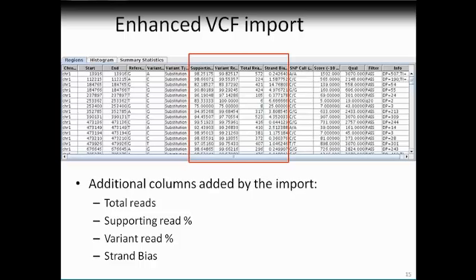And to be more precise, that effect happens to occur at the 195th amino acid of the protein sequence and results in a modification of an L to an F amino acid. Similarly, each of the other variant alleles is also annotated with the consequence that it has on the genome.